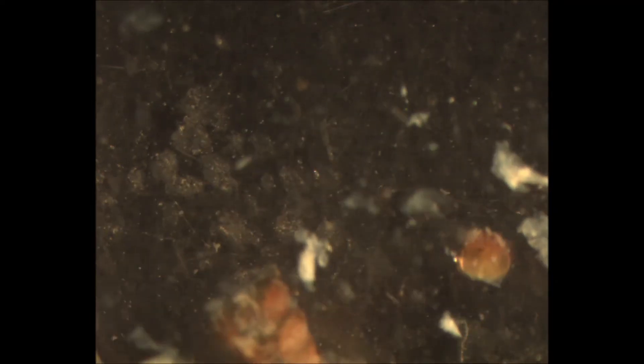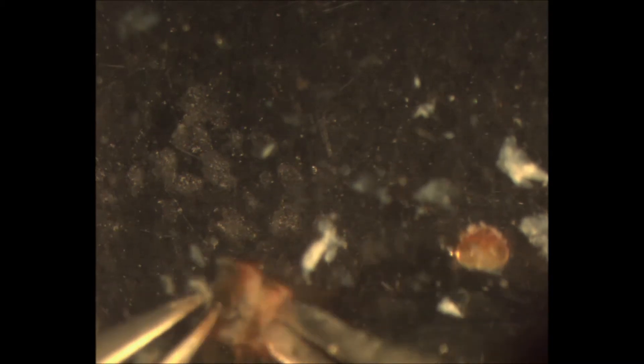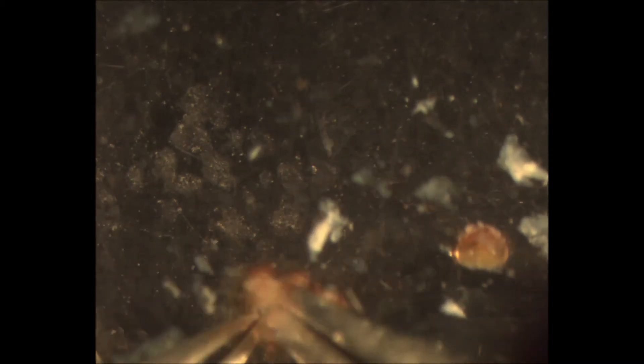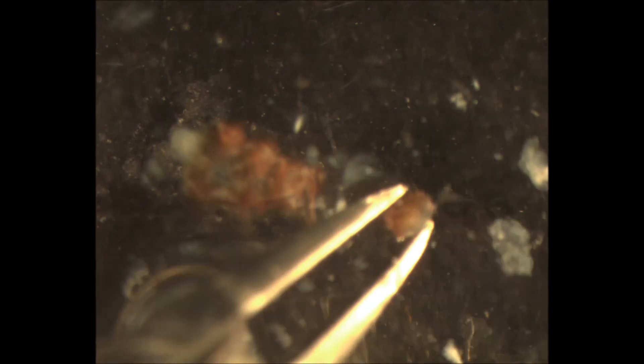I don't know why that didn't clear. I left it overnight in 10% KOH. Maybe the larvae needs to be boiled sooner. Anyway, I think that the skin will be okay, and that's the main thing. I can just move out the white stuff inside—we'll call it fat—and then the head capsule is fairly clear. I'll try to inject some water in there.